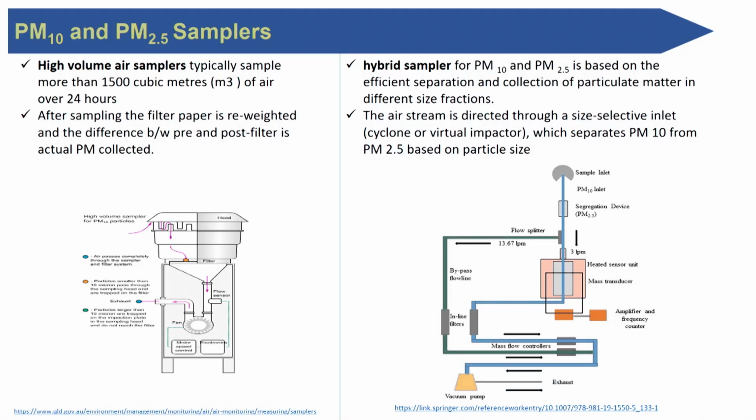We are about to complete our aerosol sampling part. This will probably be the last one, and then the next one will be on the filters. So we will be discussing this one. This is how the sampling system looks.